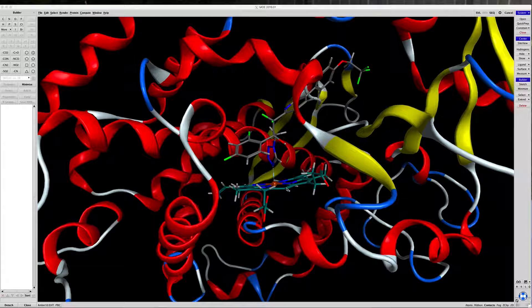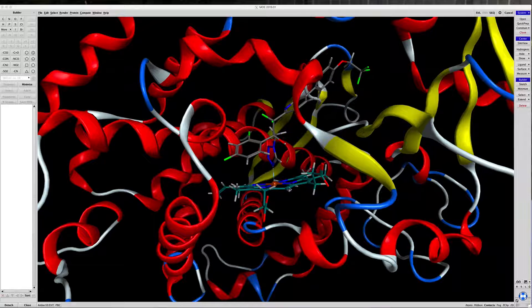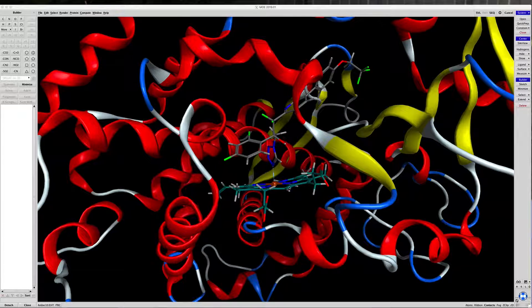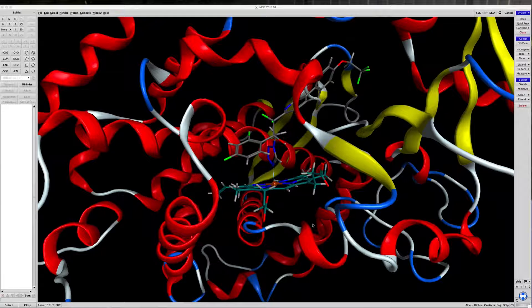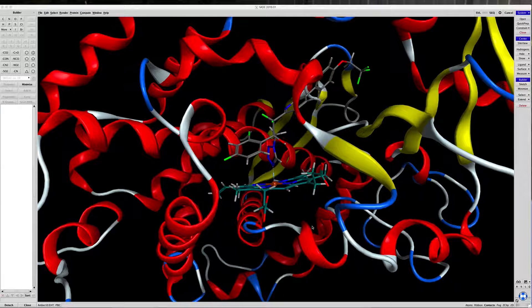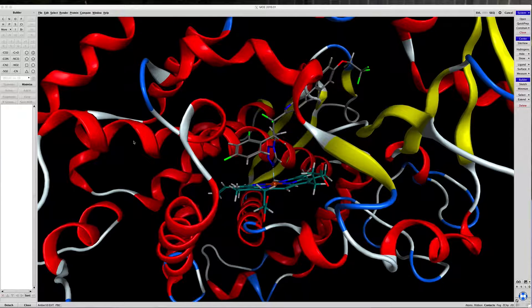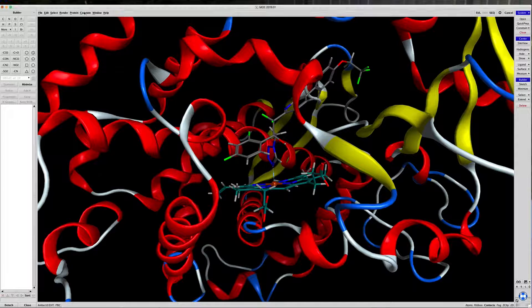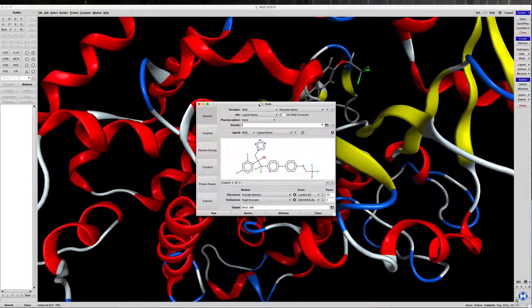I've changed the colorization of the heme to make it more visible, and I've removed the side chains and backbone residues to clean up the window. Let's go up to Compute and Dock so we can get started.